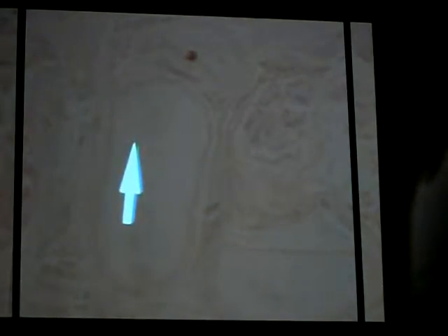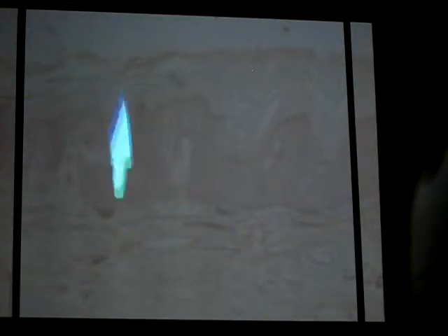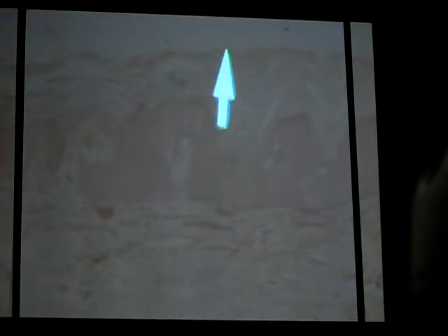Alright, so remember, they just look like a cut onion. And they're large structures that you usually find in your hypodermis. Alright, so we have our epidermis up here. Again, this is our thick skin because we have this very thick layer of keratin up here. So that's our epidermis, that's our dermis. And as we go down into the hypodermis, we can see these large structures. So those are our Pacinian corpuscles.